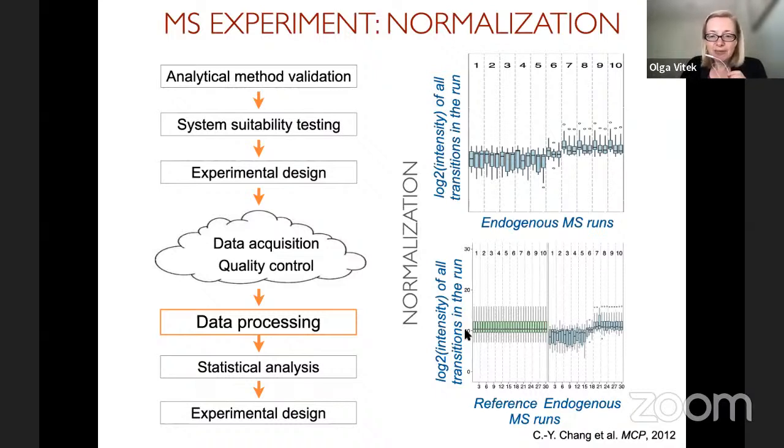Now, here we really rely on reference standards because the number of proteins is fairly small. I think it's a couple hundred proteins only. But if we're talking about a DIA experiment which quantifies, I don't know, 5,000 proteins, it is more reasonable to assume that the majority of the proteins will not be affected by the stress and only a small proportion of the proteins will be affected.